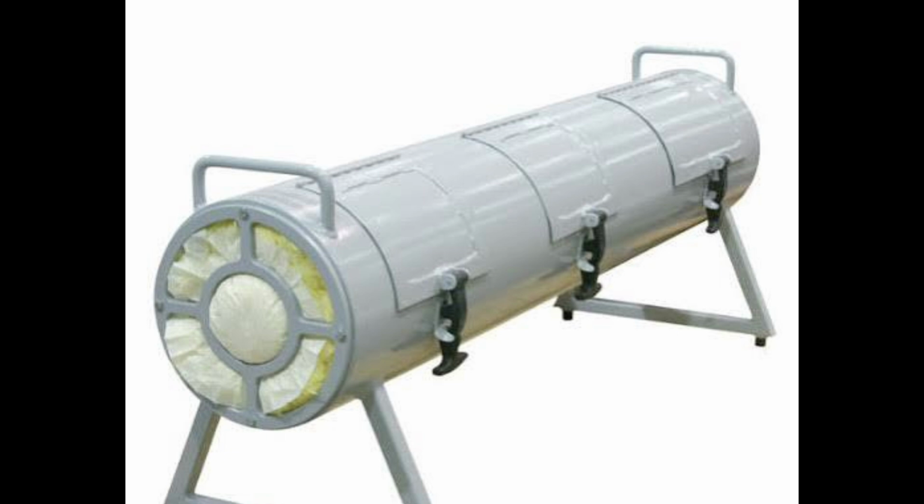The significance lies in preserving the integrity of the ballistic evidence by keeping the unique ballistic fingerprints, striations, and impressions from the barrel, firing pin, and breech face intact. Examiners can use a comparison microscope to match the test bullet to the crime scene bullet, providing vital evidence to link a specific firearm to a crime and aid in criminal investigations.